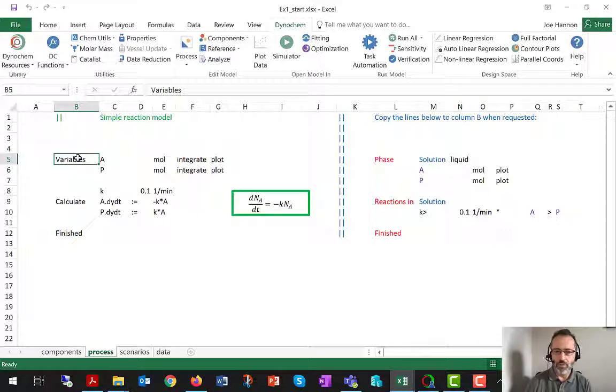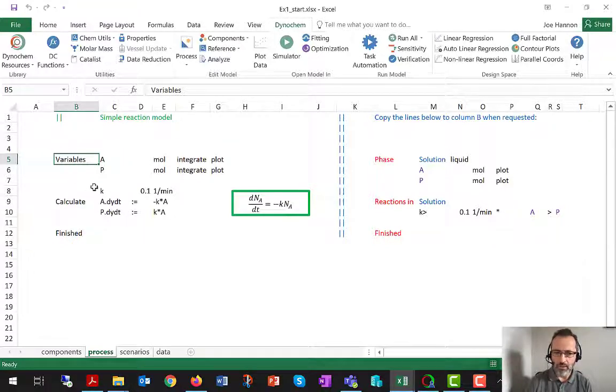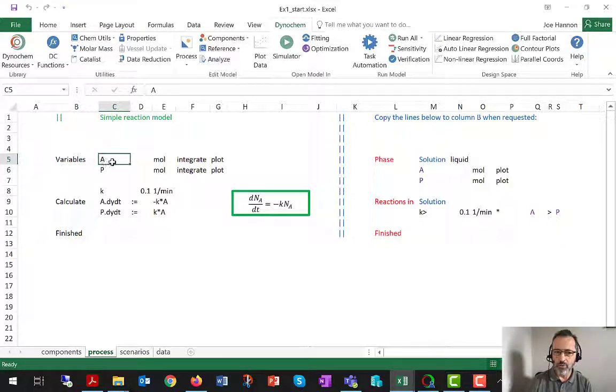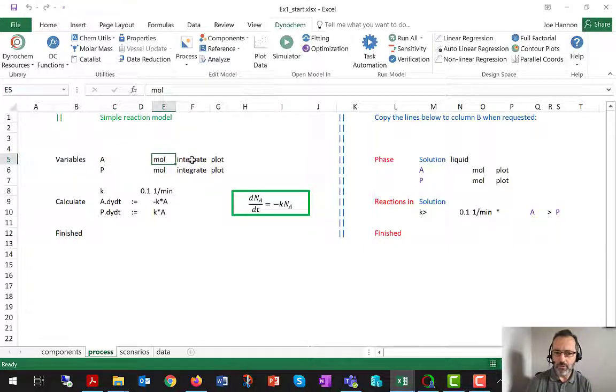So you can do that using the variables construct we've seen. We used it for the yield calculation. You can just set up a list of variables. So here we have a user-defined variable called A, no initial value, units of moles.